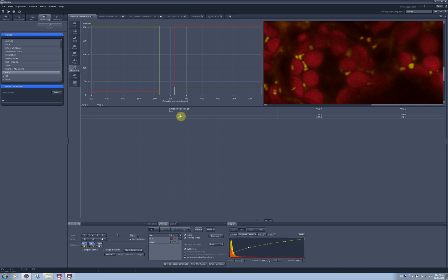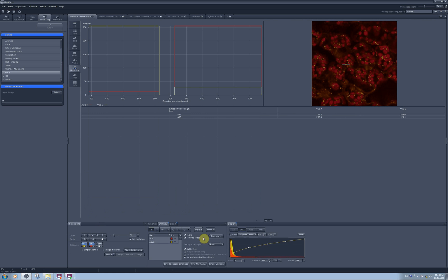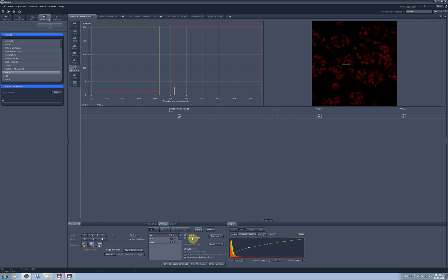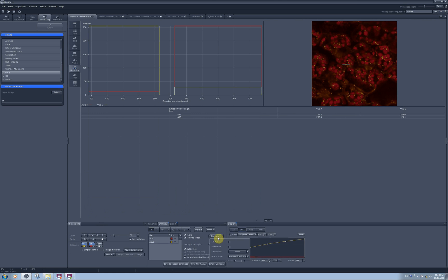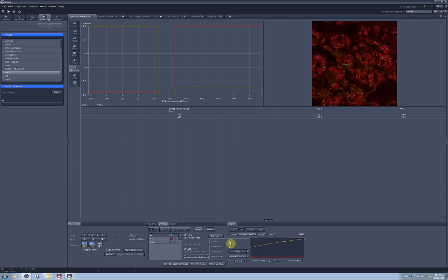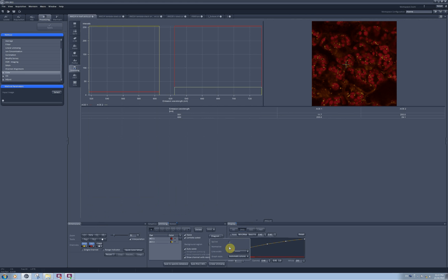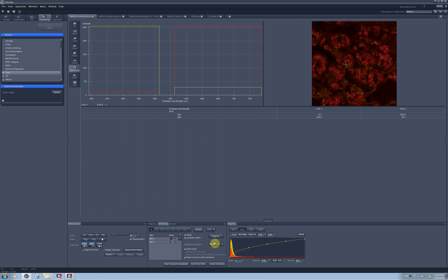Lambda coding concerns the image I'm mixing and it's just the way the image is shown to you. Diagram can be presented as spline normalized to 1 intensity. If I don't normalize it, then it sets intensity to 255 because I have 8-bit image and I have intensity from 0 to 255.